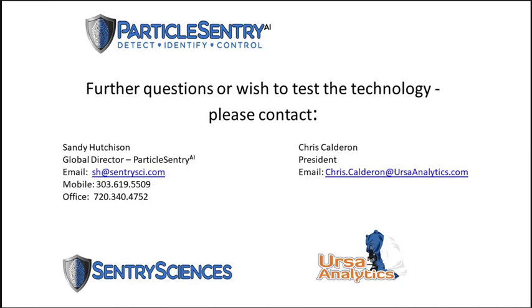All right, our next question is also from Dib. What is needed to obtain a fingerprint? So the only thing you need is a large collection of labeled images. You need your baseline condition, but it also helps to use other images from stress conditions. So think of having an accelerated stability study where you have a product that might have come from a particular stress condition, but you do light shocks, you do mechanical agitation, you do freeze thaw. Those all might be included in your fingerprint construction, because the more you can show the types of stresses that might occur, the more power this embedding technique has in representing different possibilities.